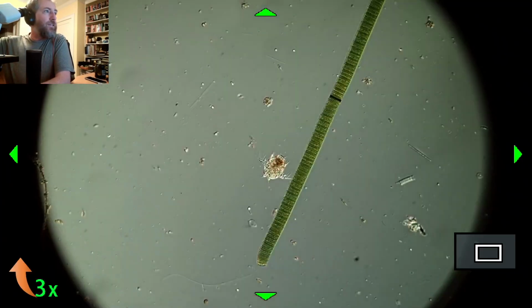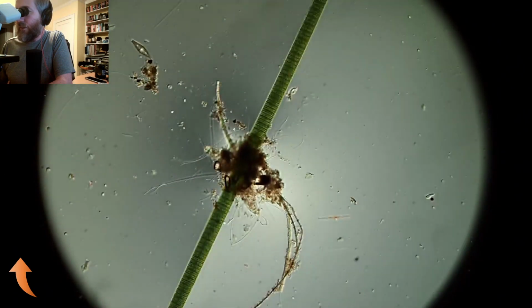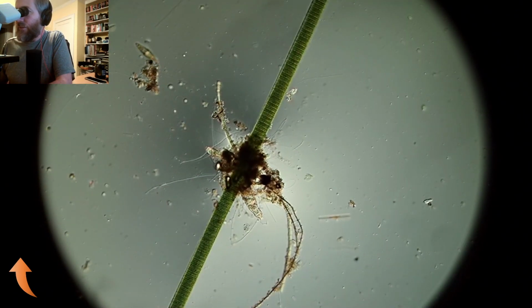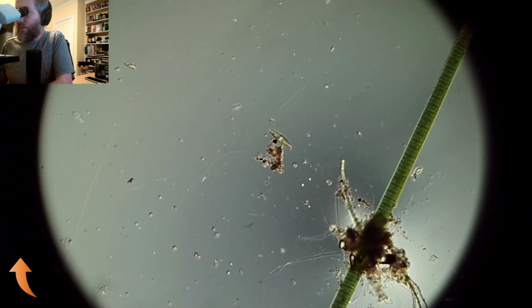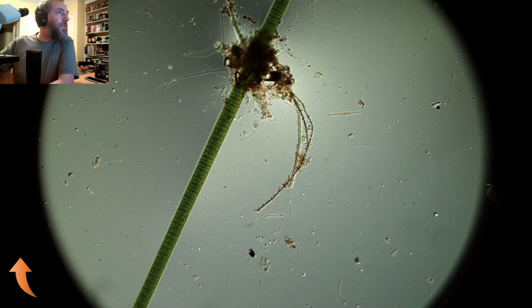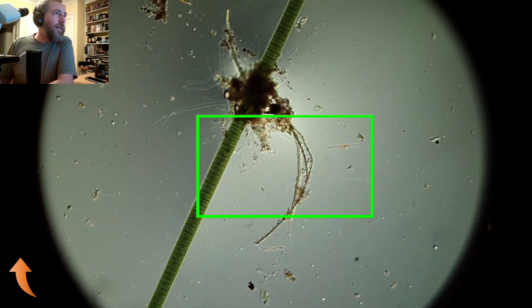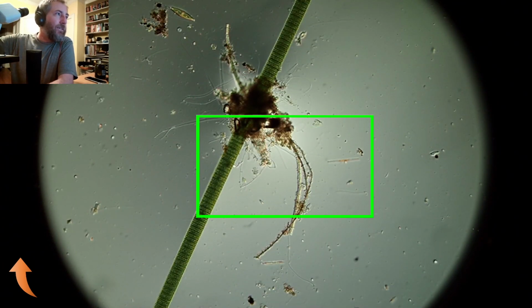And we're gonna jump back out to the full size, and then I'm gonna just browse around a little and see what we can find. This Oscillatoria is also moving just a little bit in the water. That's how you know that they're healthy. That rotifer is also just sort of parked there. We were watching it earlier, but I was kind of hoping it would stick its little corona out. Oh, it did. Pulled its corona back out. So let's zoom in and check it out, because it's a pretty cool little guy. Girl. They're all girls, by the way.